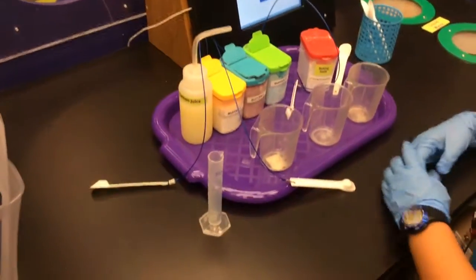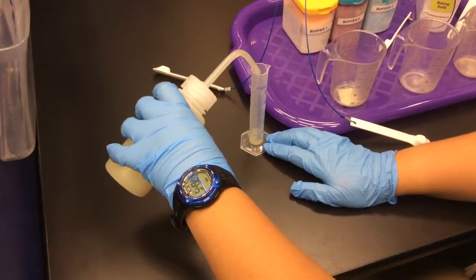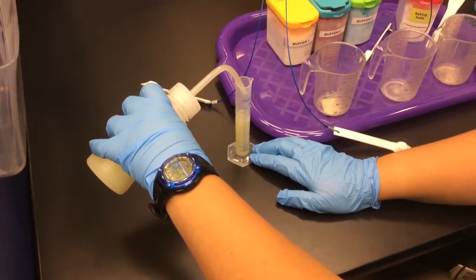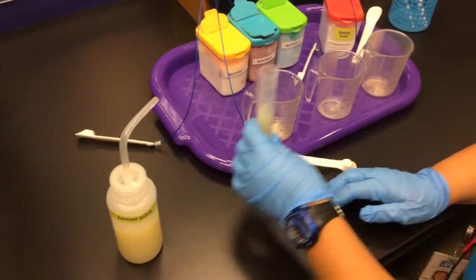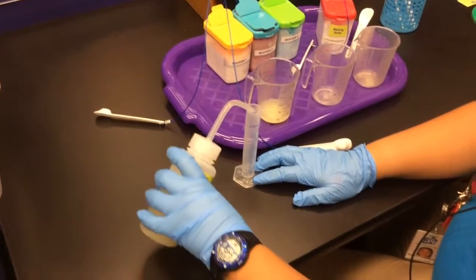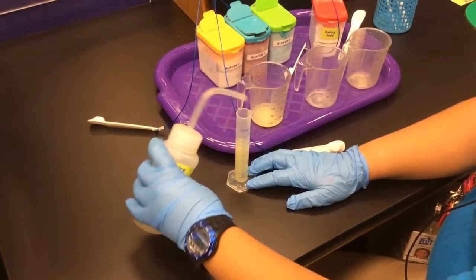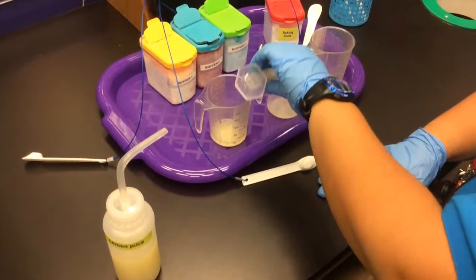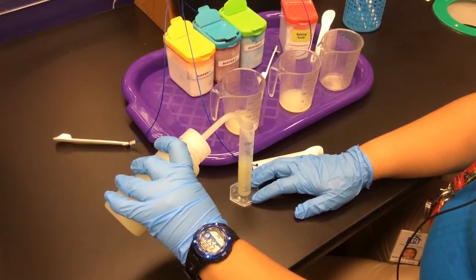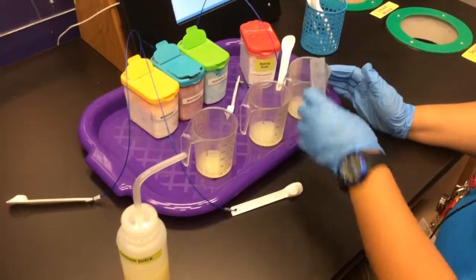The first thing we're going to do is add 20 milliliters of lemon juice to our graduated cylinder. And we're going to add this 20 milliliters of lemon juice to each one of our beakers. So that's our first one. Second one. And our third. Okay, perfect.